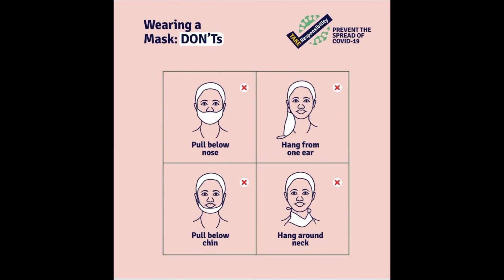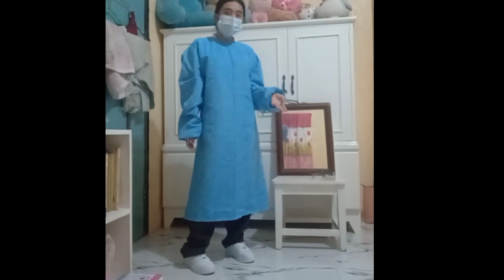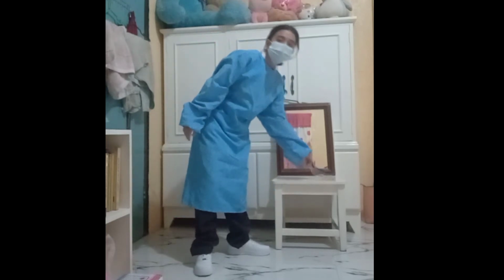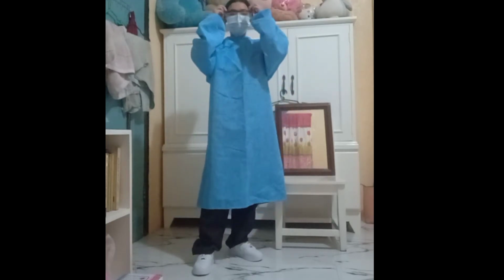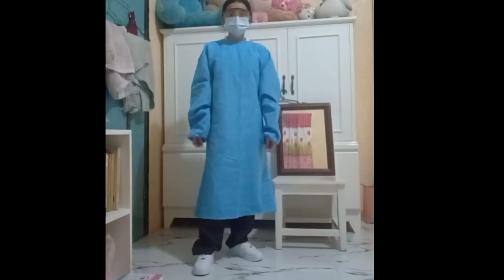Do not leave a used face mask hanging around the neck. The practice guidelines provide further instruction on using a face mask. Next, apply protective eyewear if it is not combined with the mask. If you are wearing a gown, pull up the gloves to cover the cuffs of the gown and the wrist.